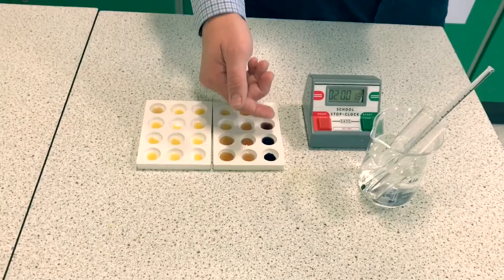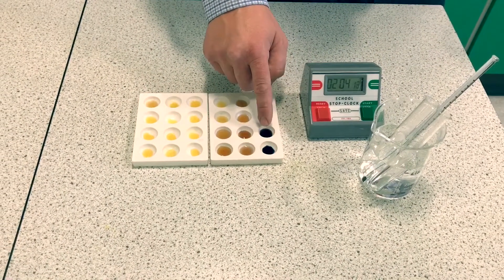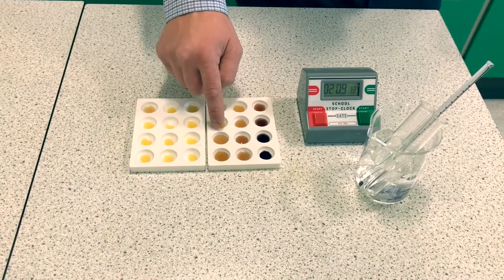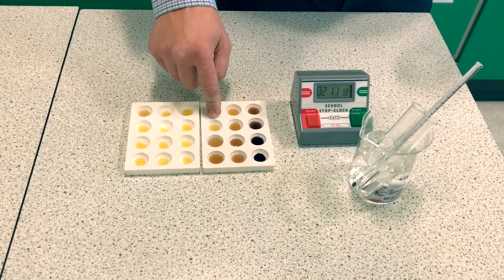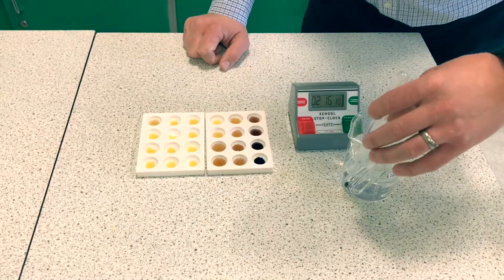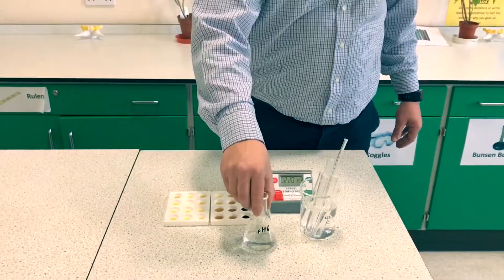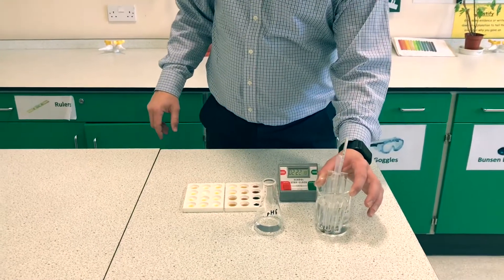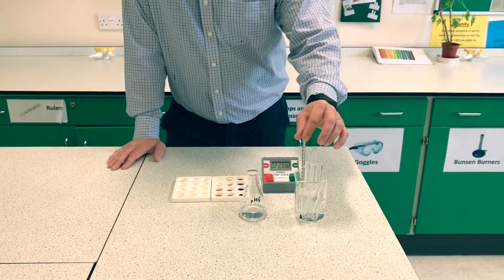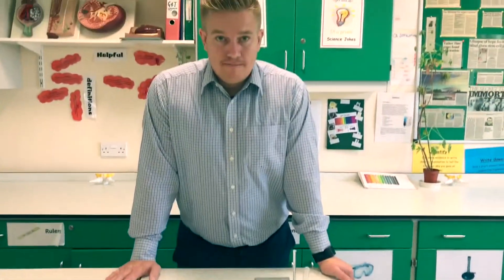This shows us that digestion has occurred. My first sample at zero seconds, then 10, 20, 30, 40, 50, 60, 70, 90, 100 seconds — one minute 40 seconds to digest at pH 6, using the three samples mixed together at a standard temperature, using 10-second intervals.